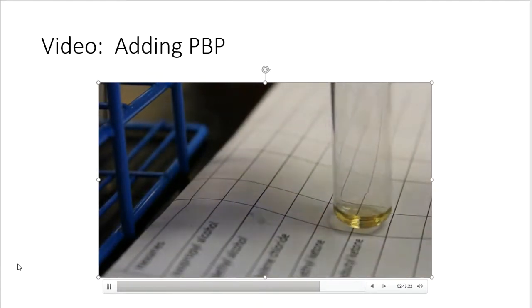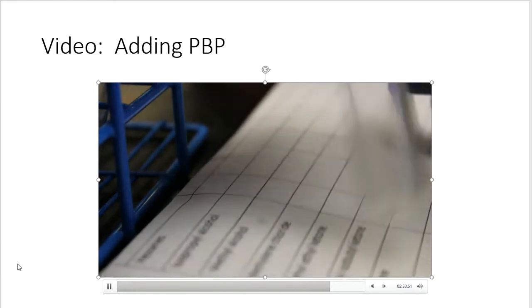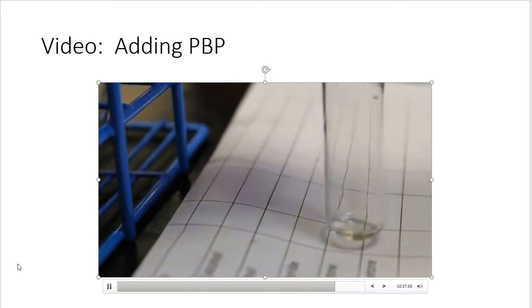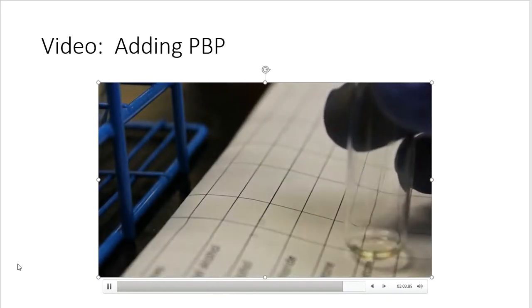And there it is. And then unknown number 2, or our last one. 1, 2. There you go. And then I'll add 10 more.